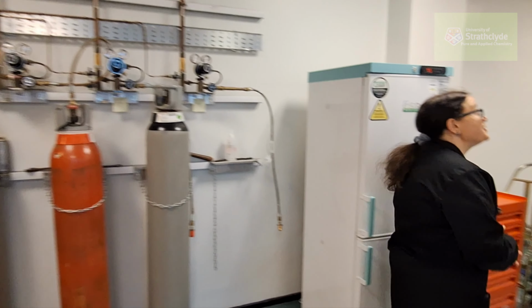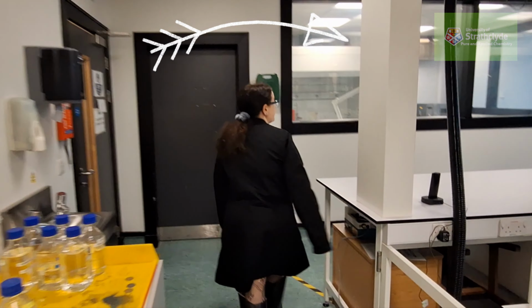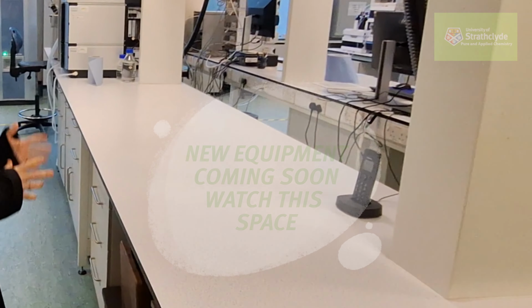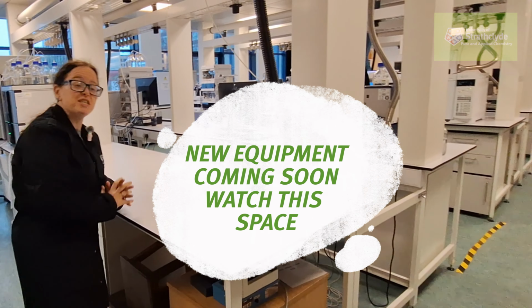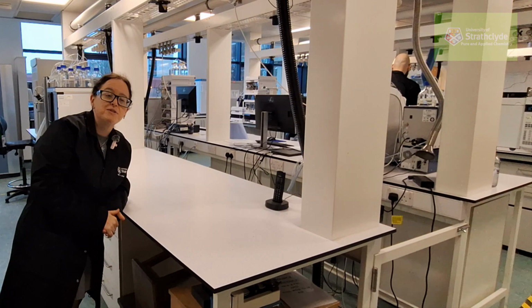We've got some exciting future things happening here in Mass Spec. We have prepared a space for some brand new kits that will be able to analyze complex mixtures and do fragmentation studies. Watch this space soon for even new state-of-the-art instrumentation here in Mass Spec that might serve your research needs.